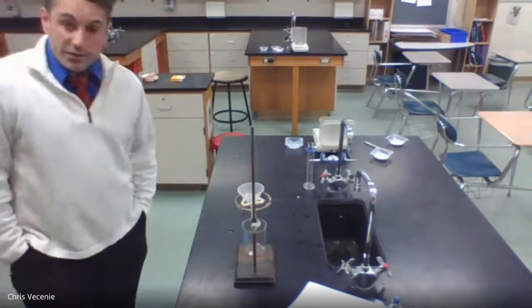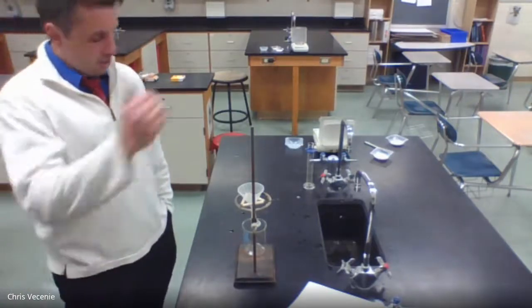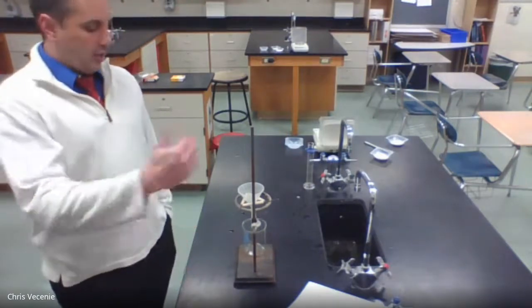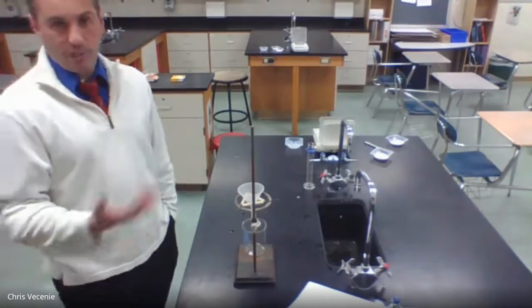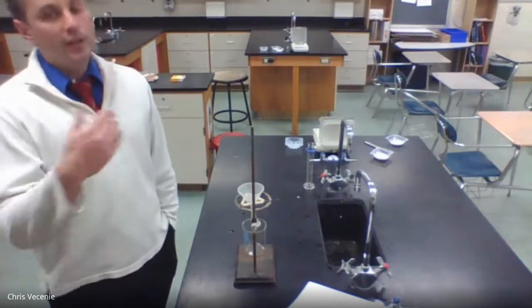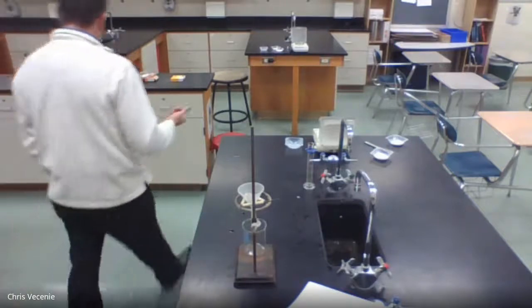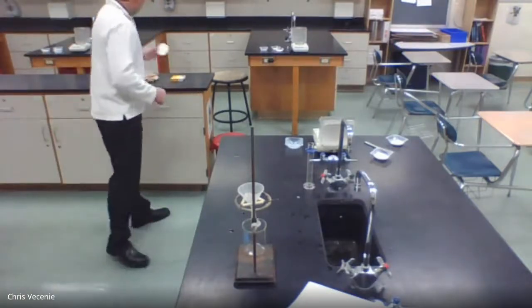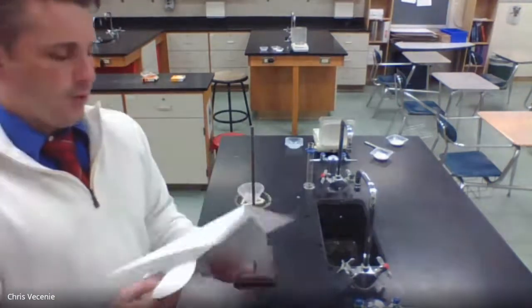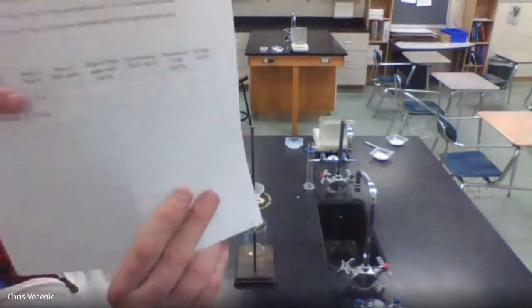All right. Now, when we start to filter this, the idea is that we don't want any of the white stuff to go through the filter paper. Otherwise, we know we're losing the product that we want. So we want our filtrate to be clear and colorless because our leftover reactants were clear and colorless, and the sodium chloride, salt water, is clear and colorless at the amounts that we're using. All right, so I'm going to go get a piece of filter paper. Okay, and in your data table, it wants us to get the mass of that filter paper right there.